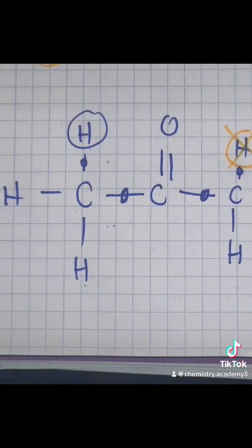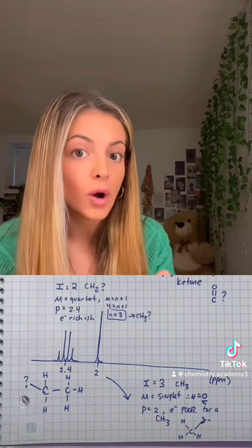Whereas for a CH3 group that's connected to a ketone, a quaternary carbon, if you circle the hydrogen on the CH3 and count 3 bonds away, 1 bond, 2 bond, 3 bond, you don't hit a hydrogen. You have to count 4 bonds to hit a hydrogen. Hence, it's not J3 away, it is not a neighbor. So it is a singlet, with no hydrogens within 3 bonds away from it.